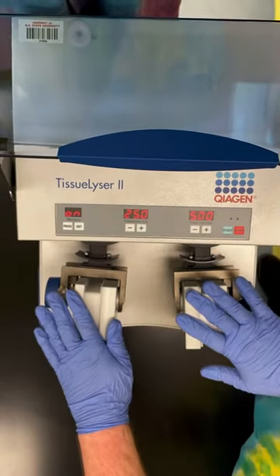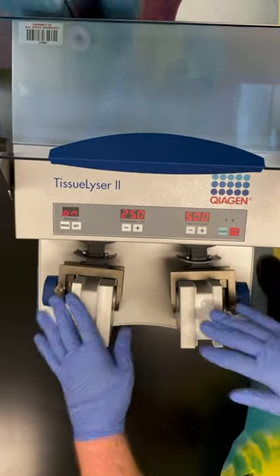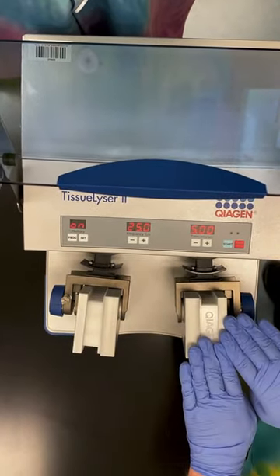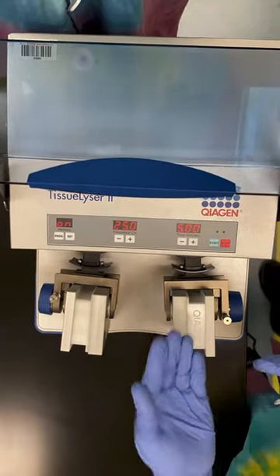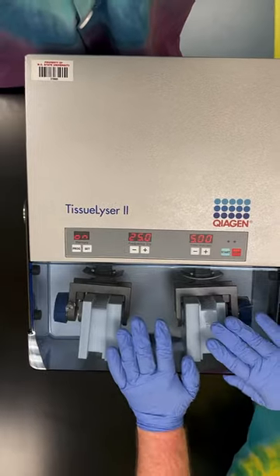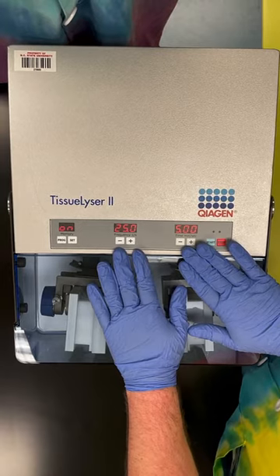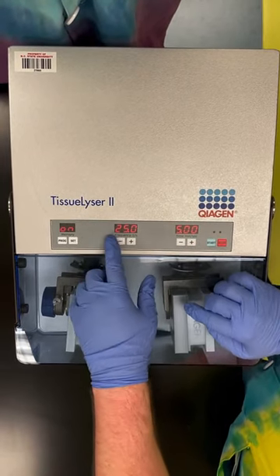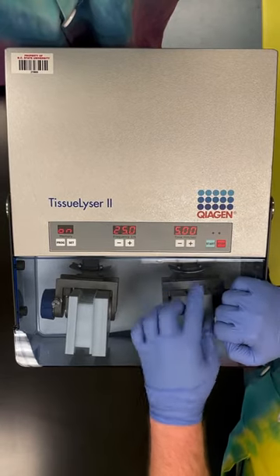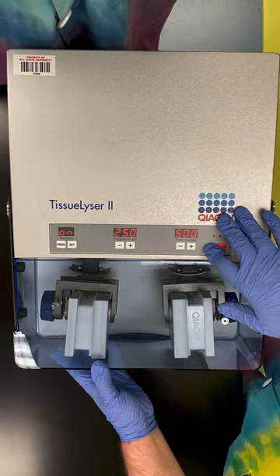Once we have everything loaded in, we want to make sure that they are balanced, because we're going to have opposing forces working against each other. These blocks can go in in either orientation — it doesn't really matter. So we're going to close the shield. Looking at our panel, we have frequency and time as the major factors. Right now this is set at 25 hertz per second, and we're going to run this for five minutes. So if everything is in and the shield's down, we can hit start and just walk away for five minutes.